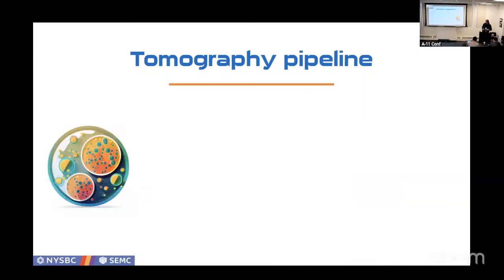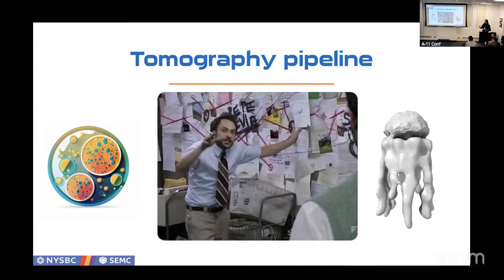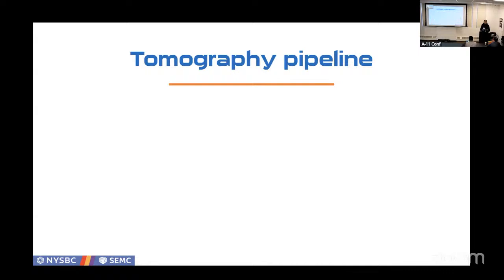All right, so how does the pipeline actually work? So you start with your favorite bug. Thank you, AI, for drawing this. Whatever that might be, your favorite virus, your favorite, I don't know, HeLa cell. Then you do tomography, and then at the end you get your reconstruction at whatever resolution. And as I was mentioning, what you want to get in the end, you better know the answer, at least how the answer looks, so you can get through all of this and adjust all the settings.